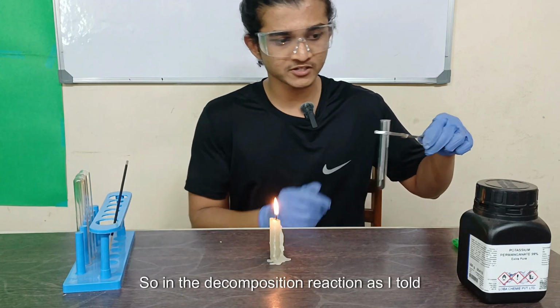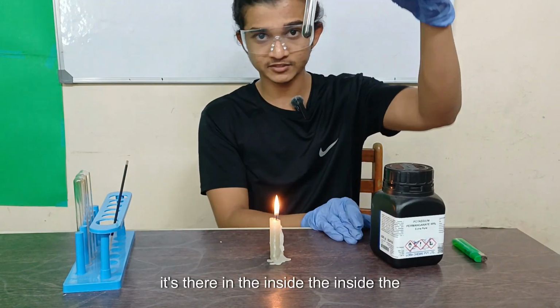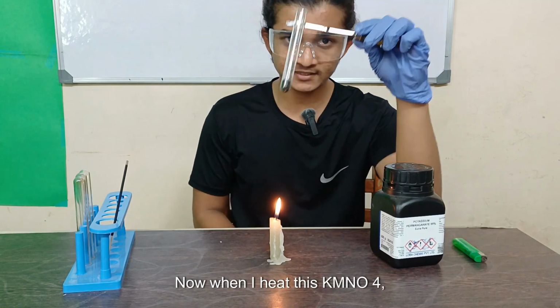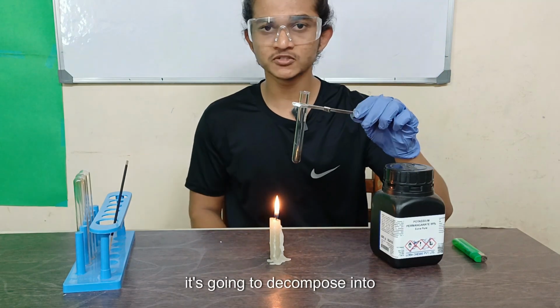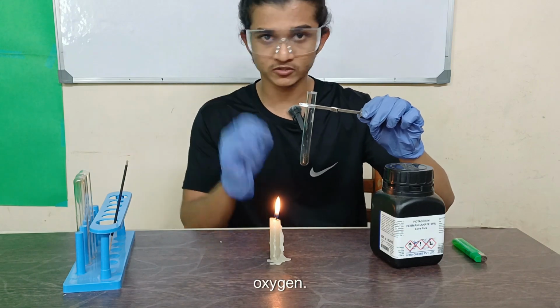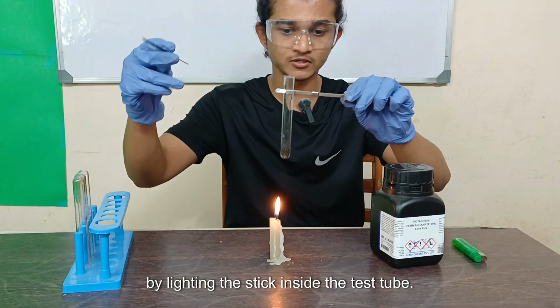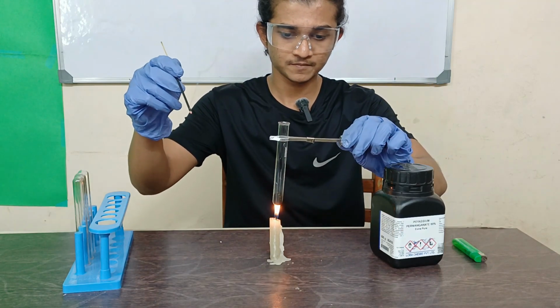In the decomposition reaction, as I told you, the KMnO4 which I have taken here is inside the test tube. Now when I heat this KMnO4, it's going to decompose into its respective products, and one of the products is oxygen. I'll check the presence of oxygen by lighting this stick inside the test tube. So let's start with the reaction.